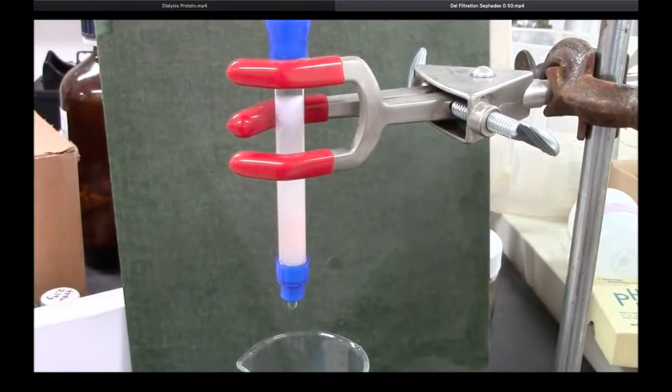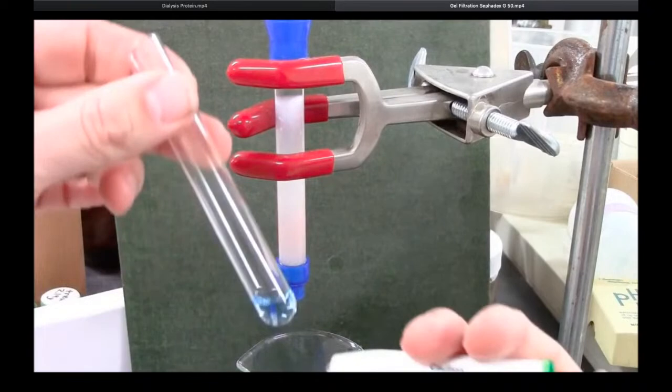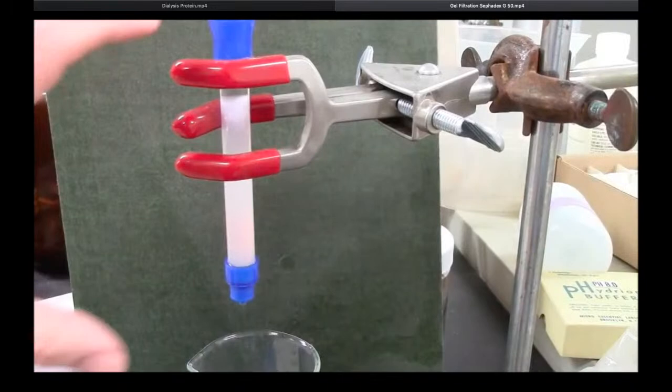And what I believe is isolated blue dextran from the column has no glow in the UV. That's a sign that I have successfully separated out all the fluorescein from the blue dextran. So the column, if I've done it well, comes out completely colorless.